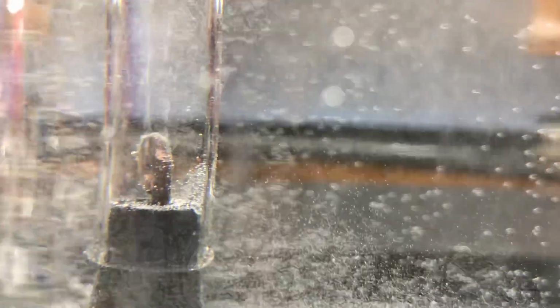Just that little tiny stream of bubbles coming up now, probably just a small amount of magnesium.